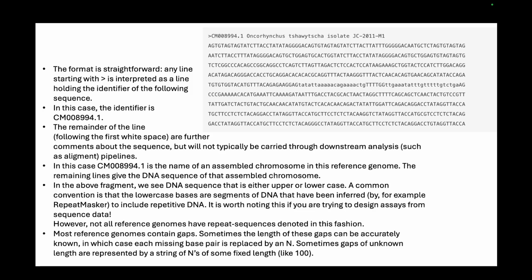So you completely shut off that part of the genome, so that other erroneous reads do not come and bind to the part. So you can do multiple things for masking. If you're using N instead of the capital letters, it's basically hard masking, and if you just convert the capital to a small letter, it's basically soft masking.